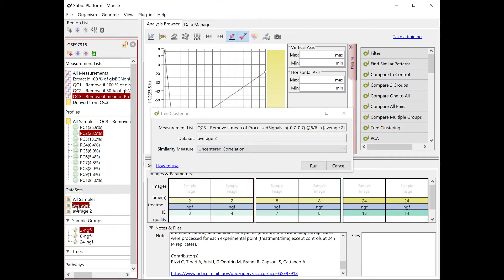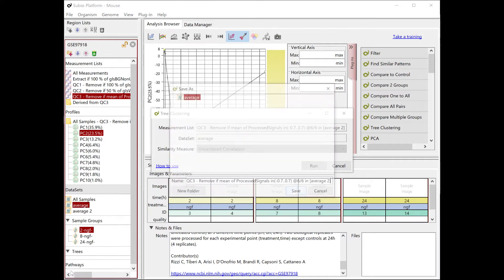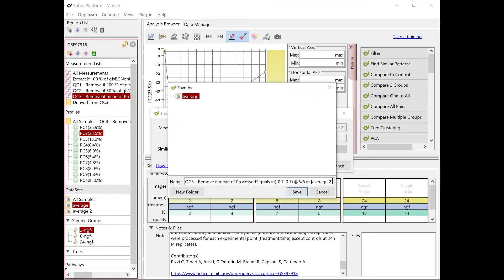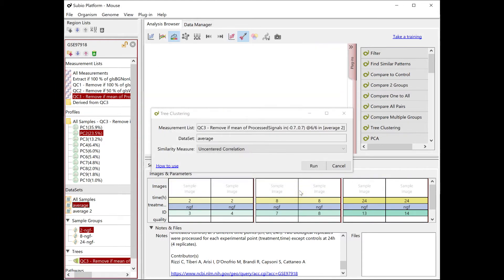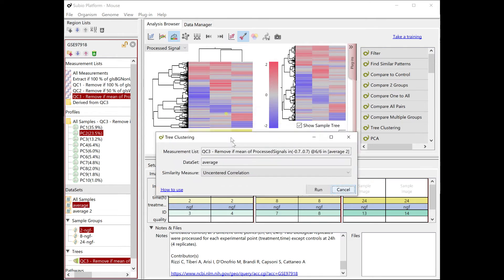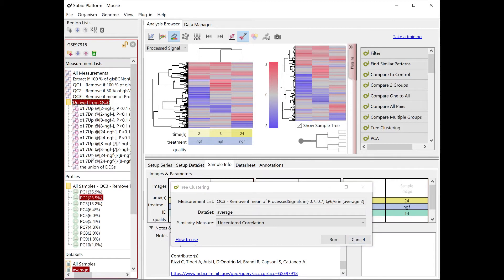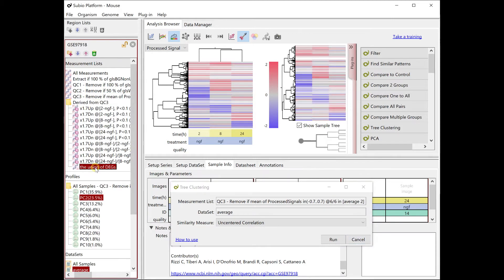Now we run the hierarchical clustering with the QC3 list and the average dataset. As expected from the result of PCA, the genes that are upregulated and downregulated at each time point are unique. There is not much overlap.